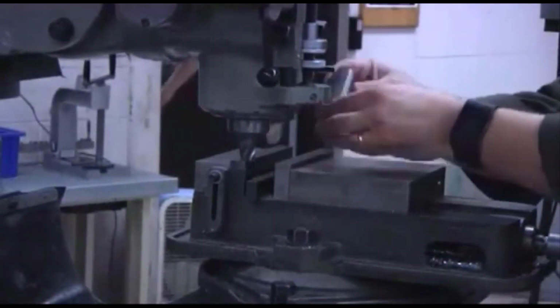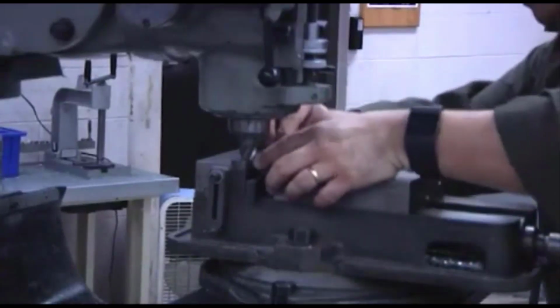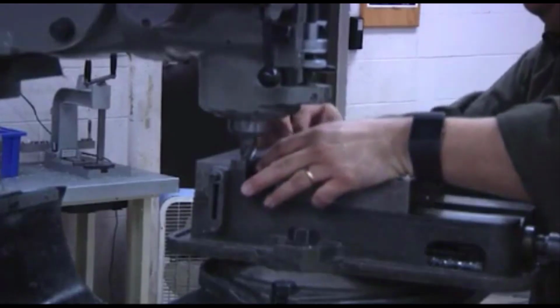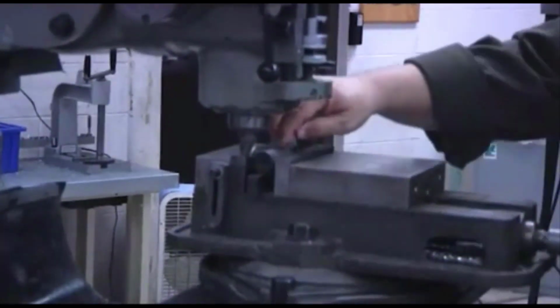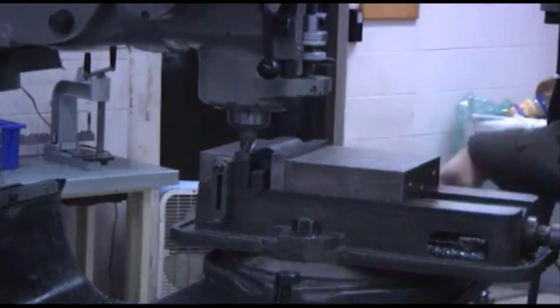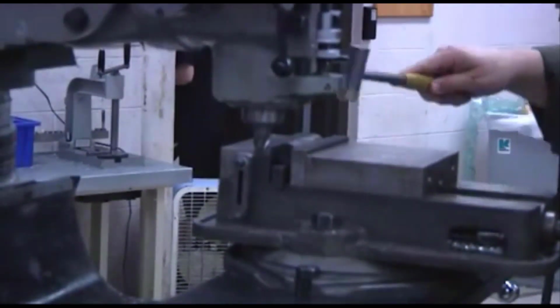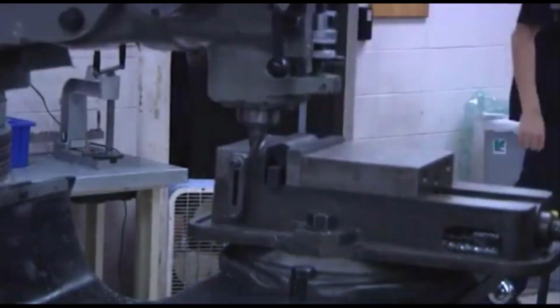All right. And you can see the first surface. Lay the specimen back in there, and we're resting the specimen on that flat so that we guarantee that the second flat is automatically parallel to the first one. So we just need to be careful clamping it in the vise that it doesn't roll. Tap on it just to make sure it's firmly in contact with the support underneath it.